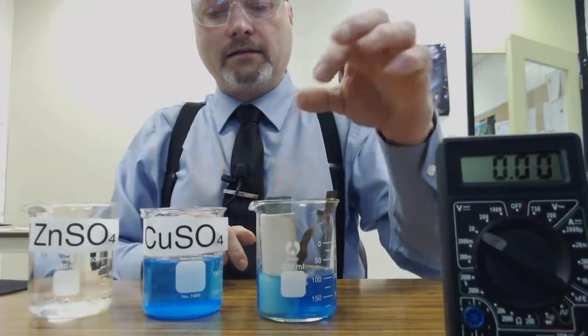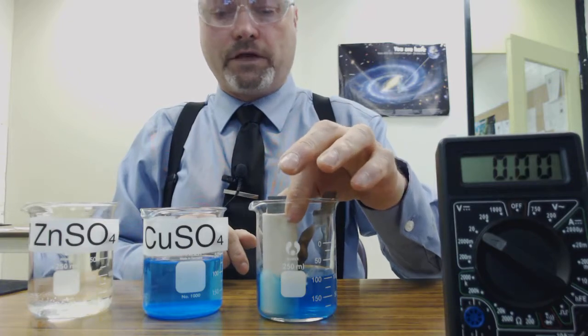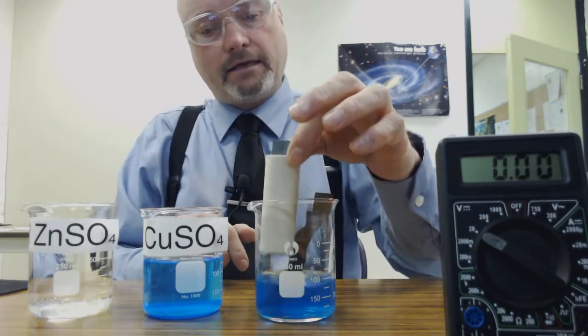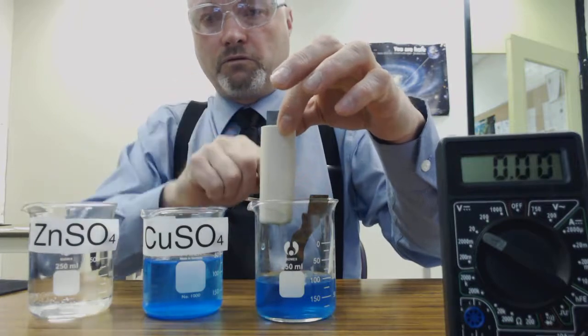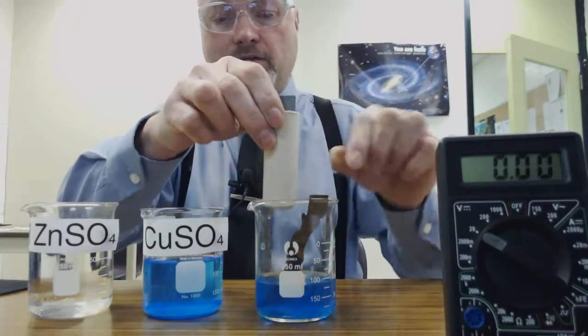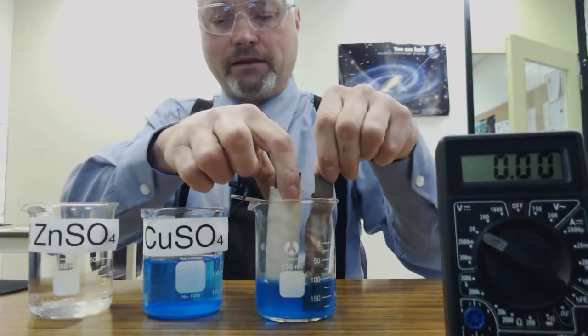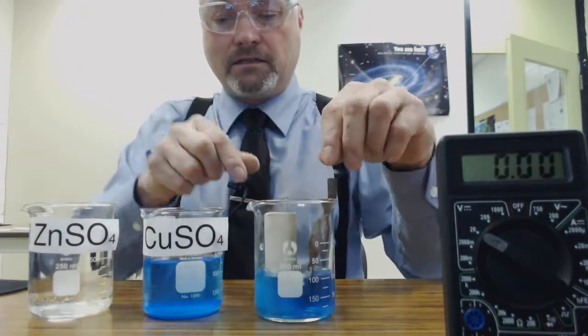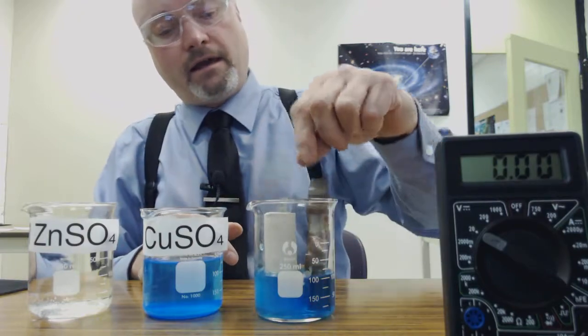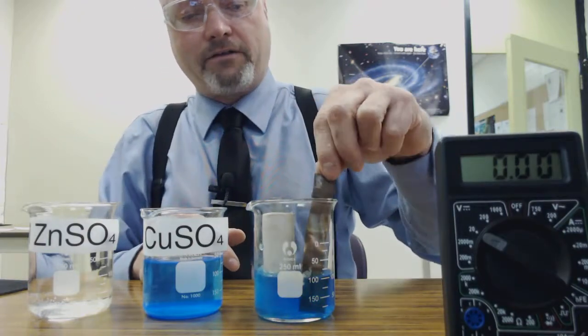This galvanic cell isn't connected by a salt bridge to balance the ions, instead it uses a porous cup. We've soaked this porous cup in sodium chloride so the ions can travel across into each solution to balance the charge as the electrons are passed from the anode to the cathode.